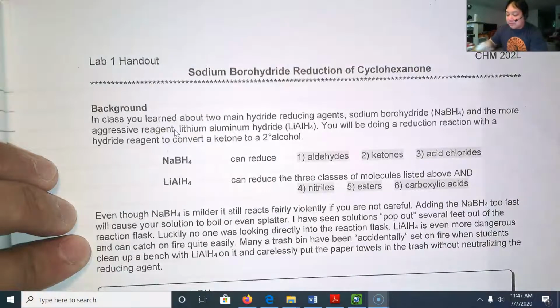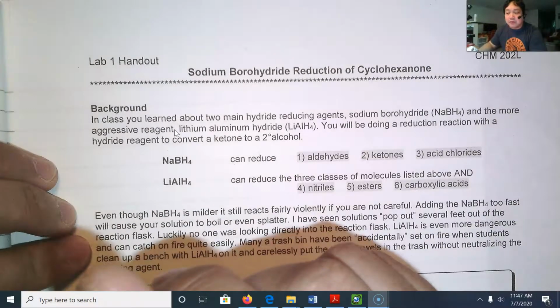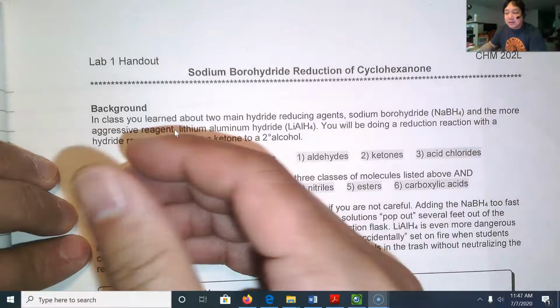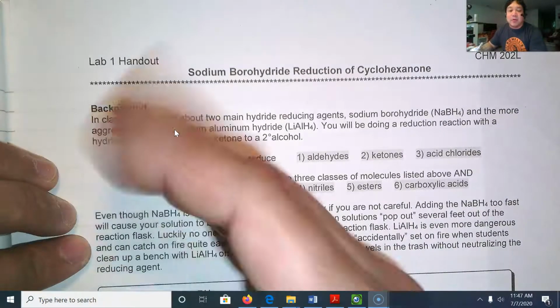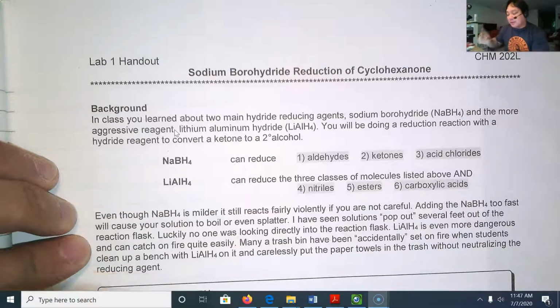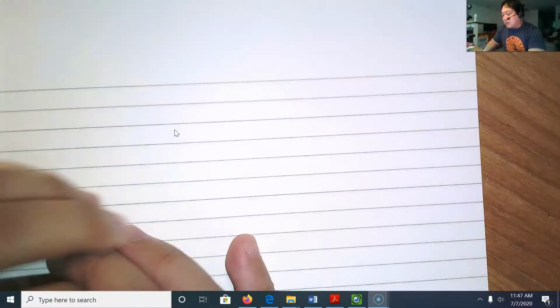In a different video, I plan to show you how to write your pre-lab entry, the information that I expect to see in your notebook when you walk into lab. All right, so there's going to be two different videos. You could take notes in your lab notebook. Again, your lab notebook should be a bound composition notebook, no spirals.